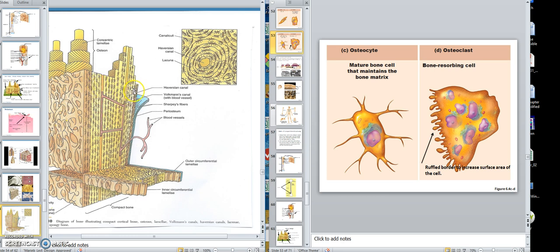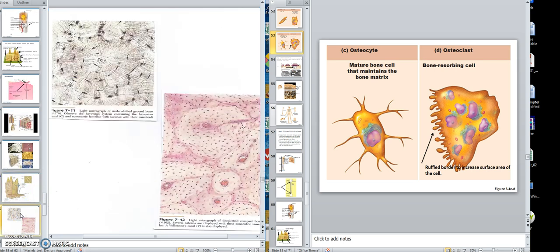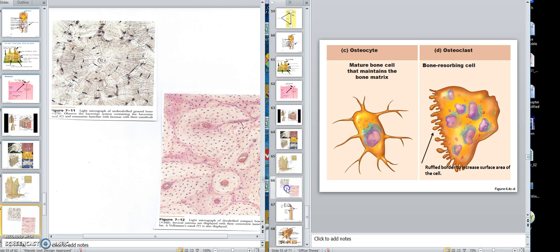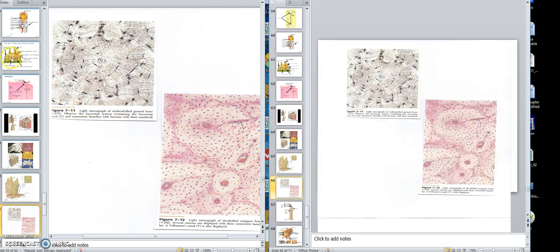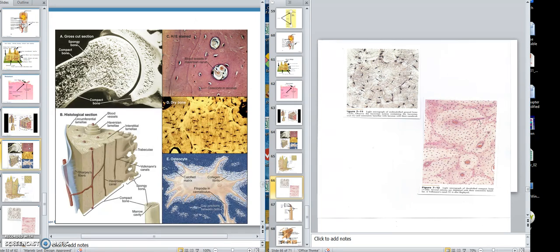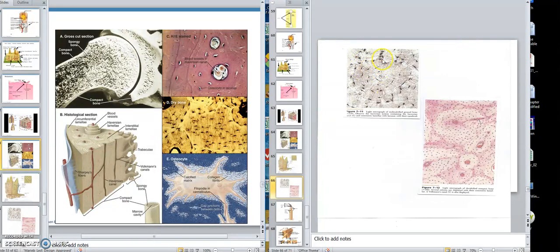Now this is spongy — we're talking about compact, we'll get to spongy in a little bit. Here is a ground bone section. This right here would be one osteon, this would be the central canal. These dots here would be the lacunae where the osteocytes are in, and these would be the canaliculi where you have the processes of the osteocyte in.